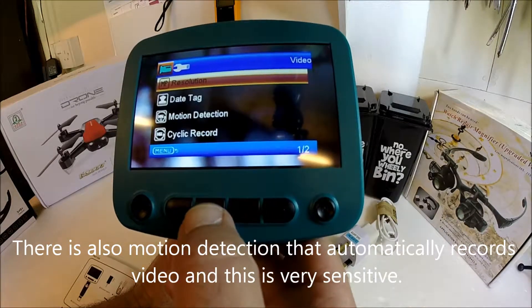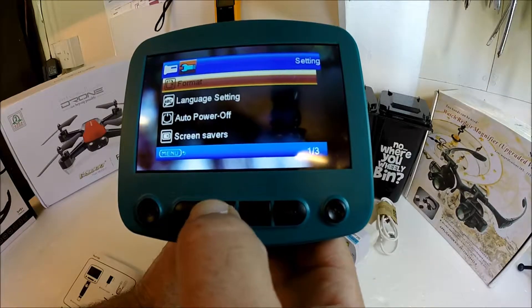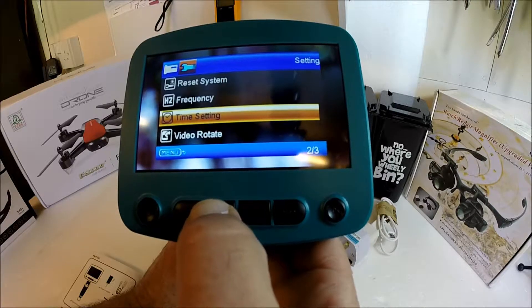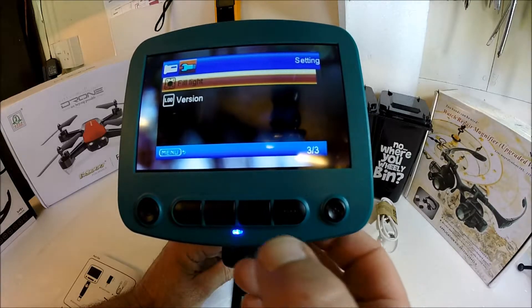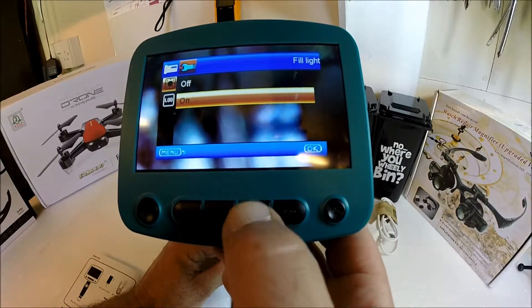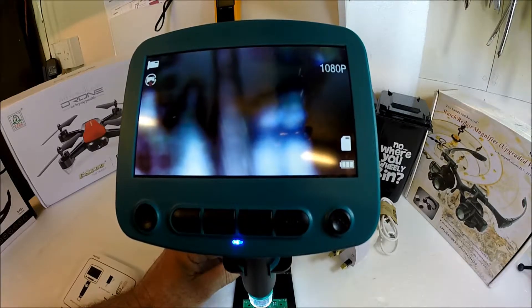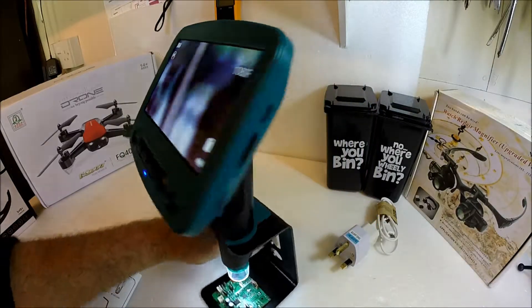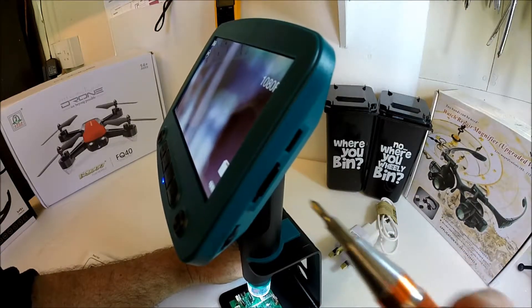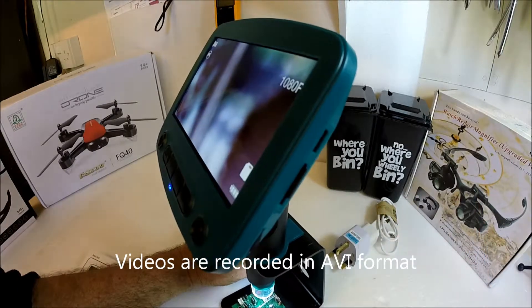I'll need to go into the menu and turn off the fill light. We'll press OK on that, turn that off, come out of the menu, and we're back onto the main screen. You will need to supply your own microSD memory card. I've got a 4 gigabyte in there, which will be more than enough for what I need.